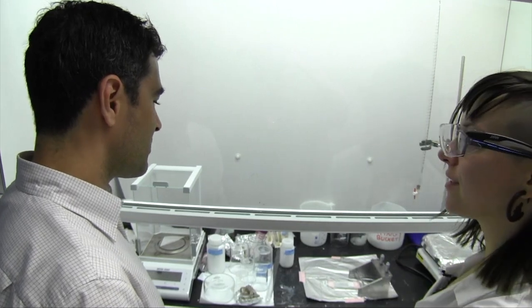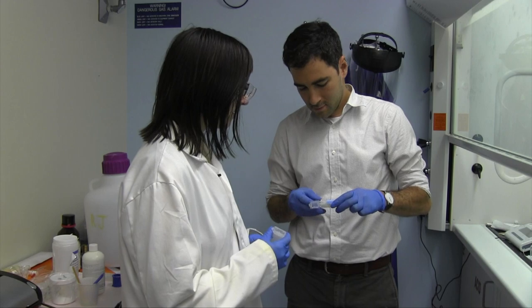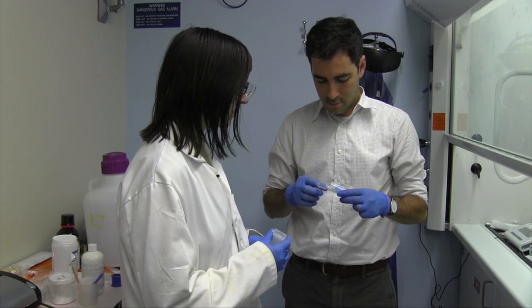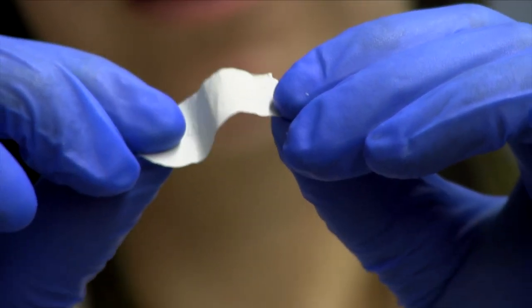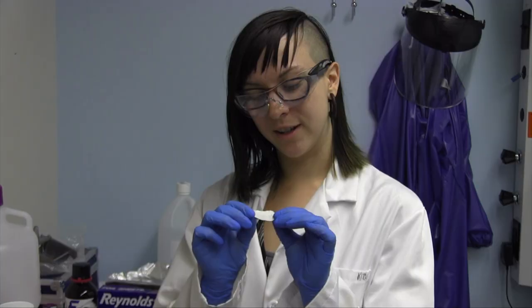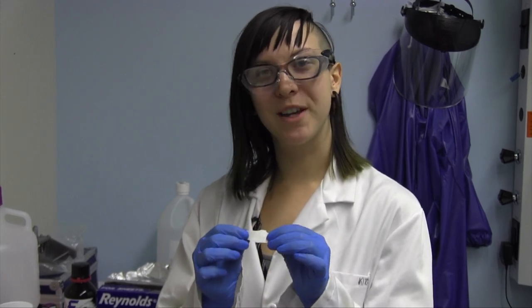It's sort of a trial and error, definitely, but I have quite a few samples. These ones, especially the ones towards the back, are the most recent samples. So this is our best sample. As you can see, it is flexible, much more durable. It doesn't come apart as soon as I pull it, and this is what we're going to be working with on the next steps.